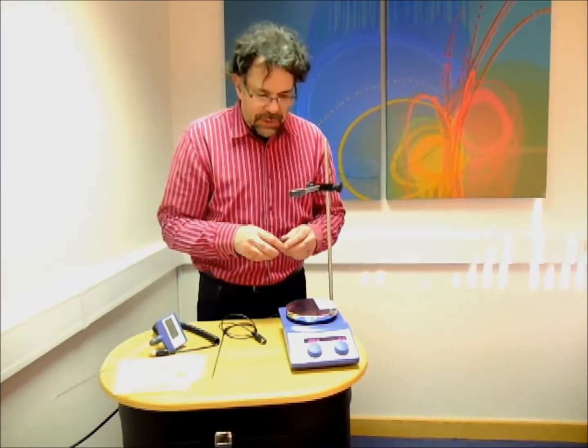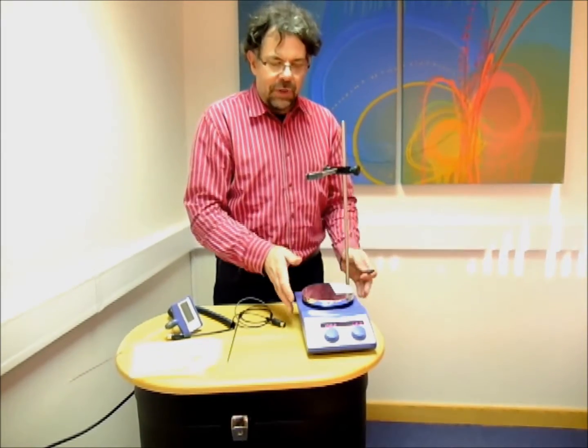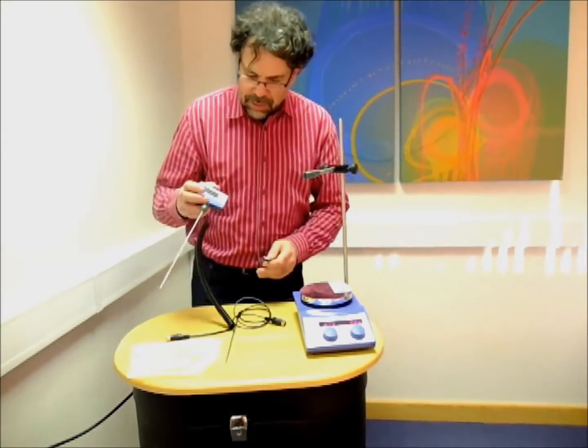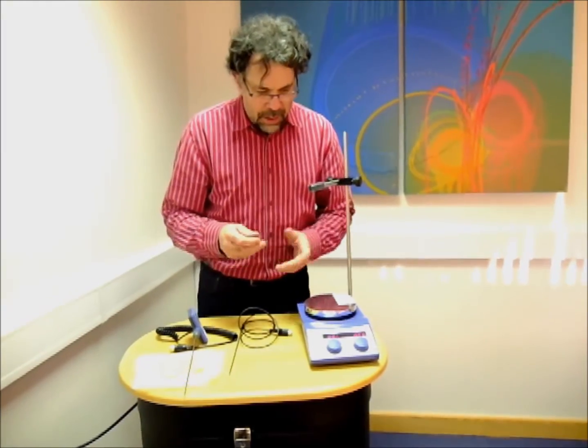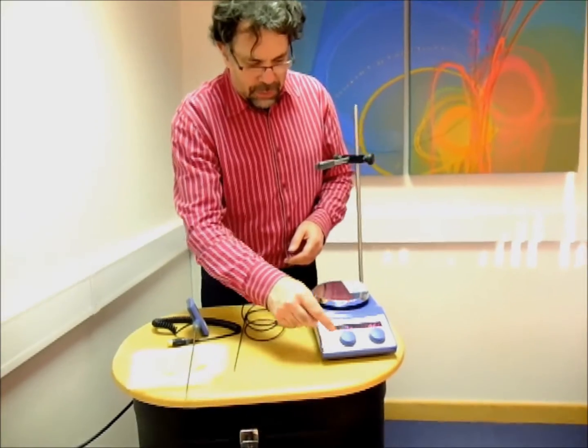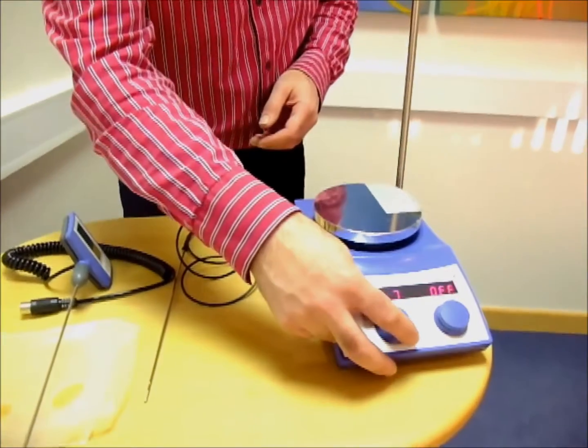Let's go into some of the safety features. Many hot plates only have one temperature circuit. Here we have two in the hot plate, and with this probe we have three totally independent temperature circuits. The first circuit, which everyone's aware of with most hot plates, is the simple control of hot plate temperature using this dial.